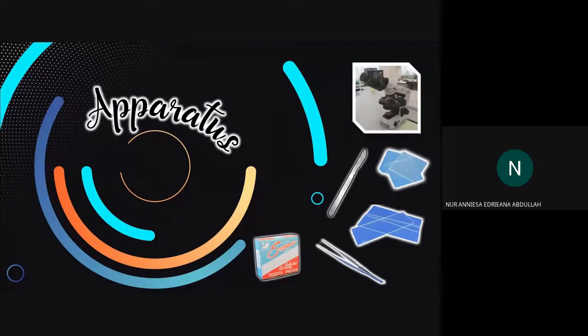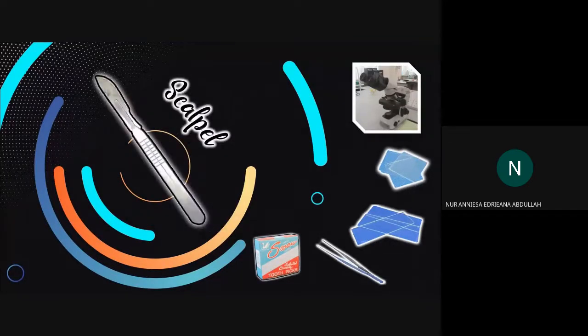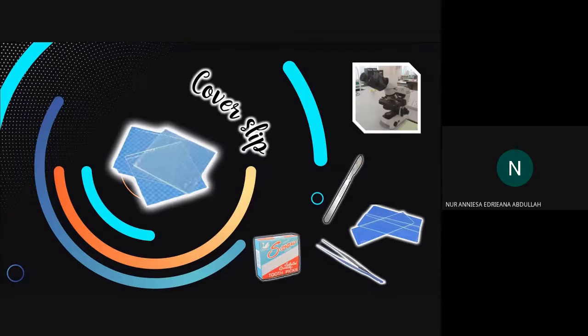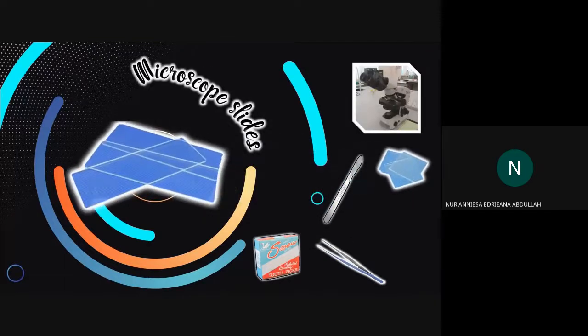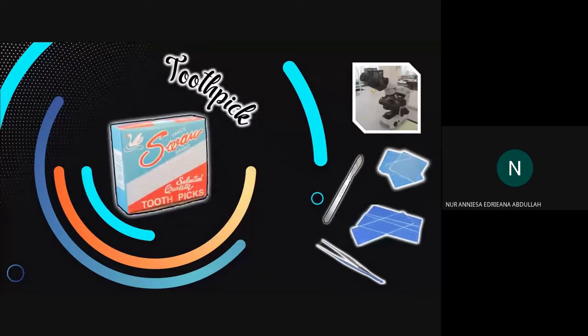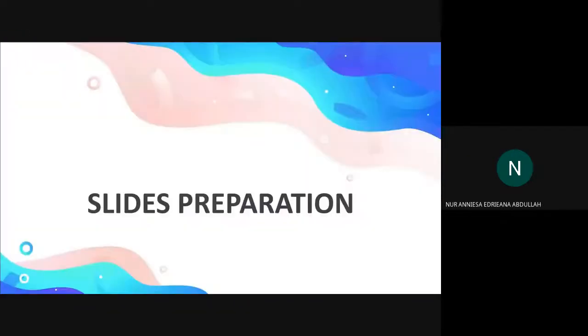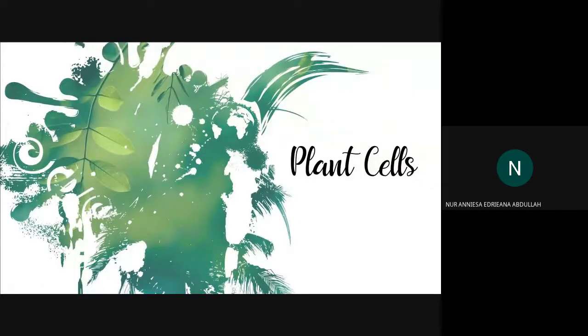There are 6 apparatus to complete this experiment. The first one is scalpel, forceps, cover slip, microscope slides, toothpick, and a microscope. Now, let's start preparing the slides. For plant cells, we are going to use onion epidermis and iodine as staining.